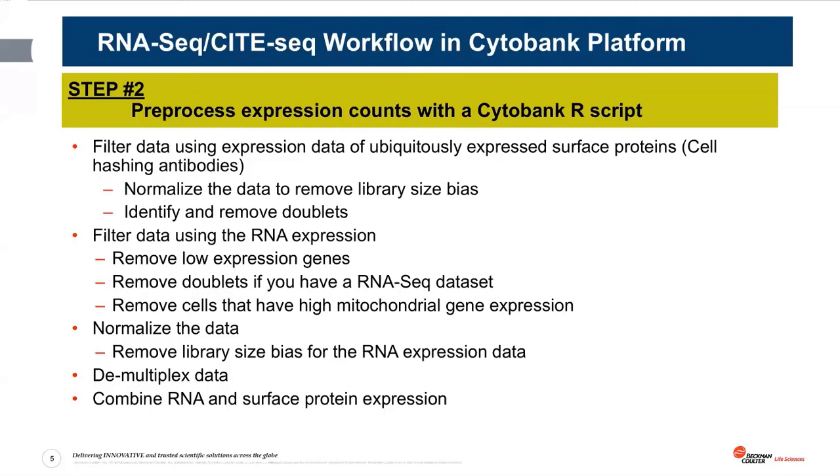And this is also different from regular cytometry data analysis, where you would not remove channels or remove markers unless you need to merge data that are generated on different panels.